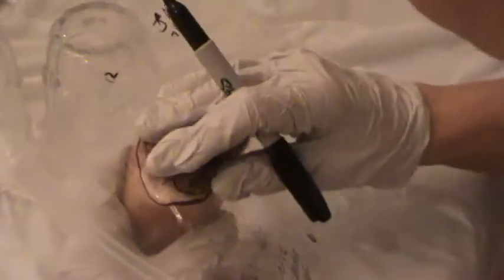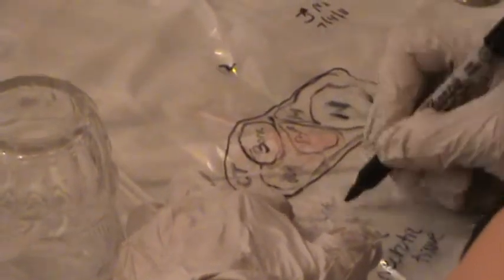The only thing I did not notate, which I'm going to go back and put on my tracing, is some connective tissue, which is some fat I see over here, connective tissue on the left-hand side. So I'm going to just notate CT for connective tissue on my tracing. Again, it's a little steamy today, so I'm trying to get my Sharpie to cooperate. Alright, some connective tissue on that left-hand side, margins labeled, if that's visible on the video.